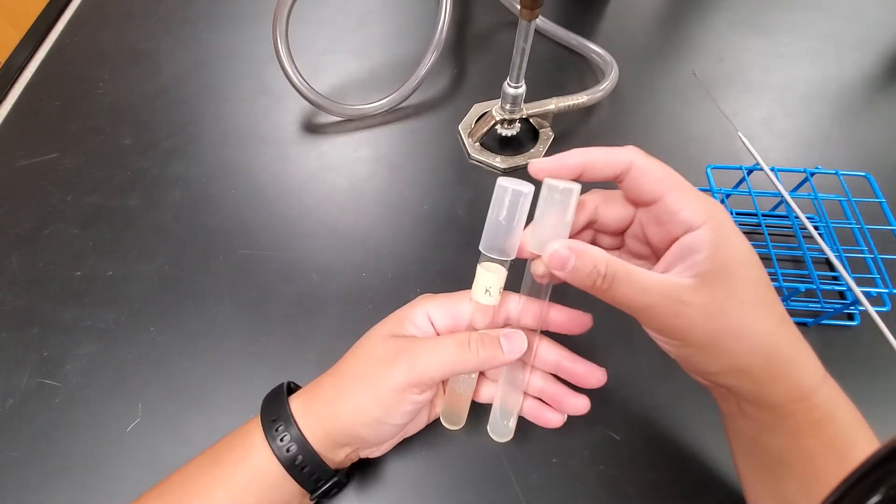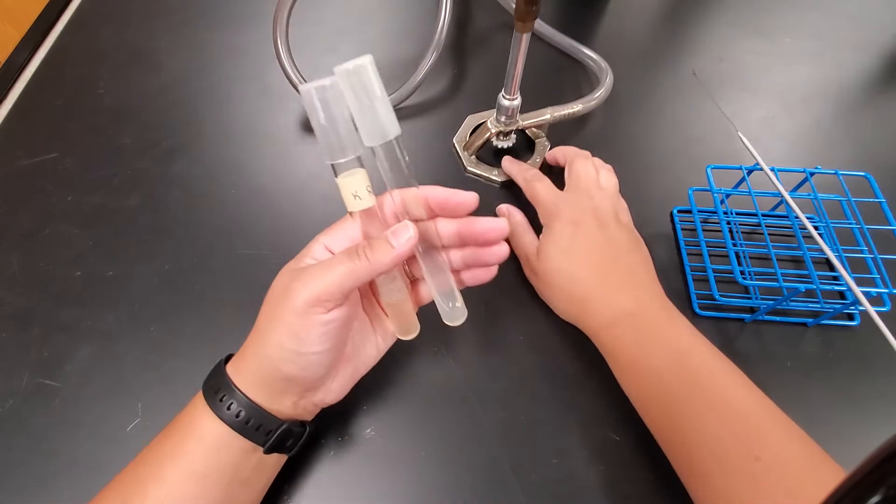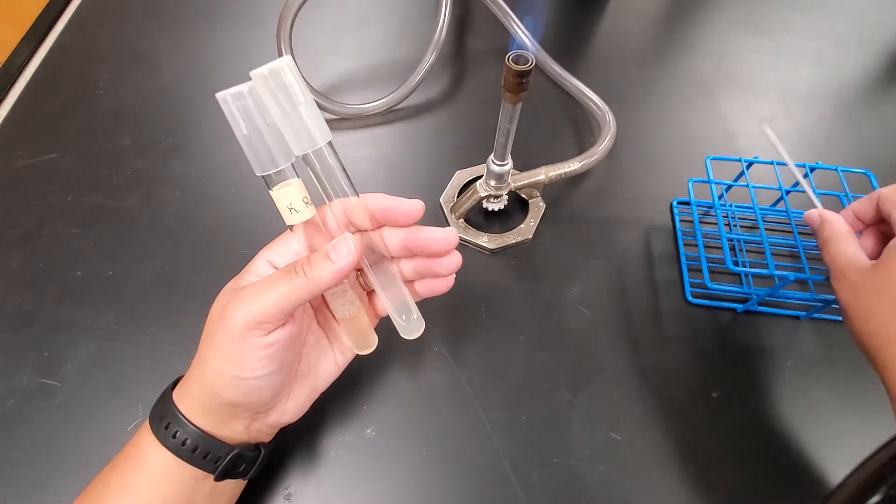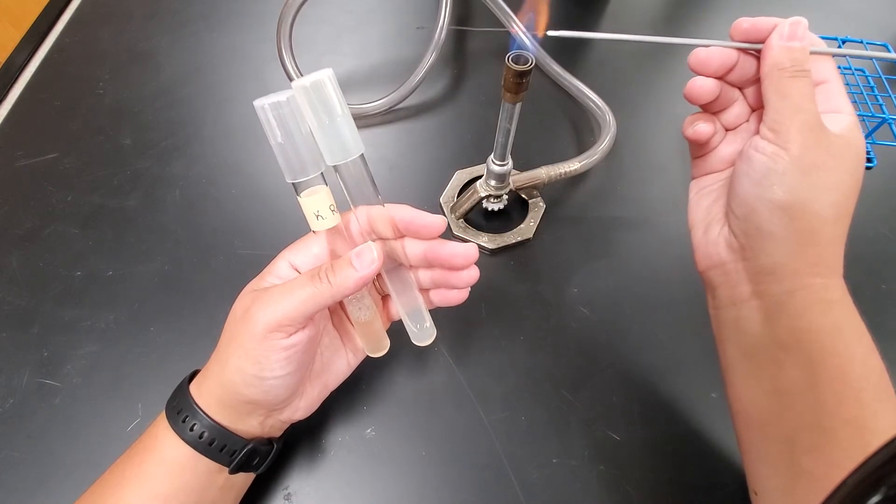So what I'm going to try to do is put my agar slant here just so you guys can see how I do this transfer. I've already got my Bunsen burner flame going. So the first thing I want to do is flame my loop.